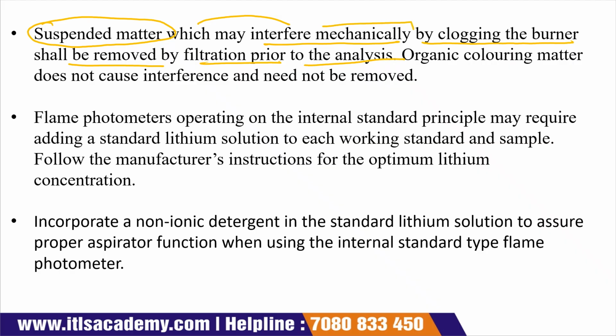They clog the burner. So we can remove that suspended matter by filtration before starting our analysis. Organic coloring matter does not cause interference and need not be removed.